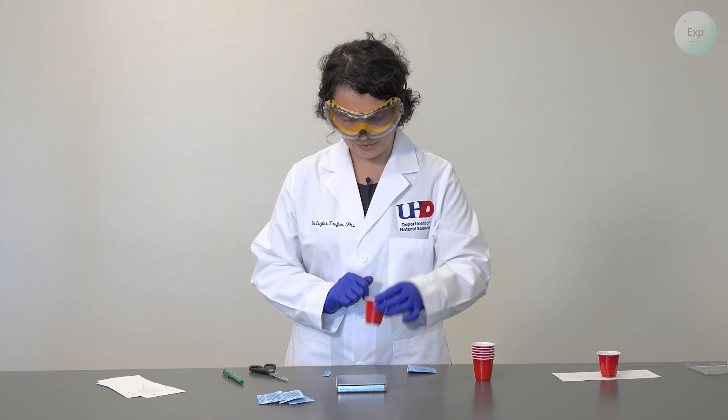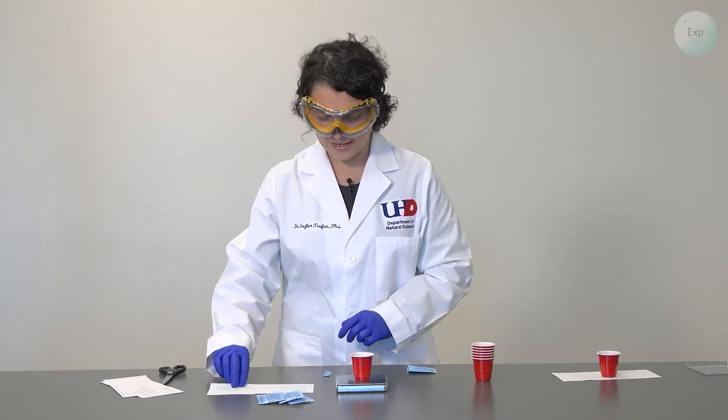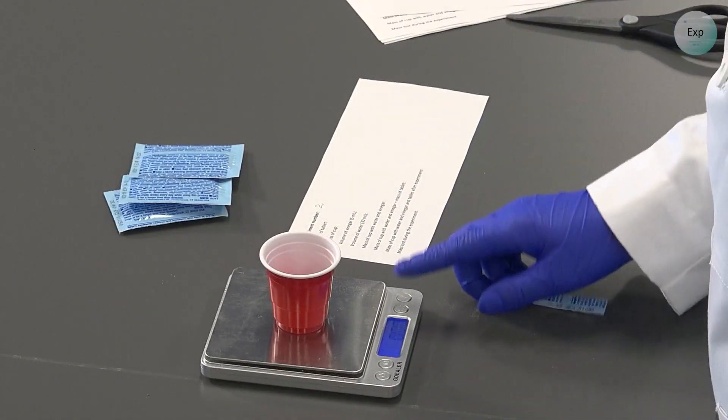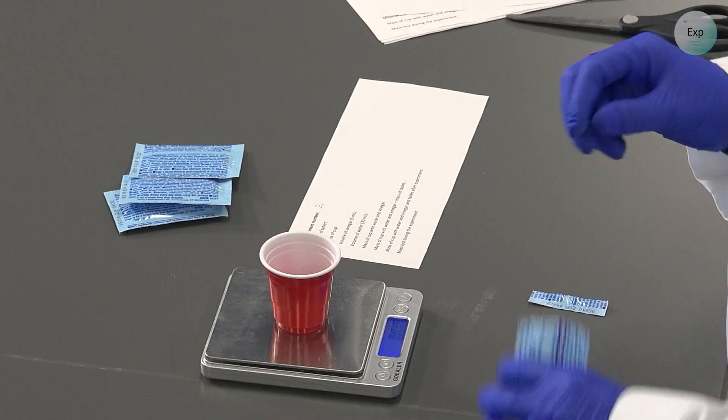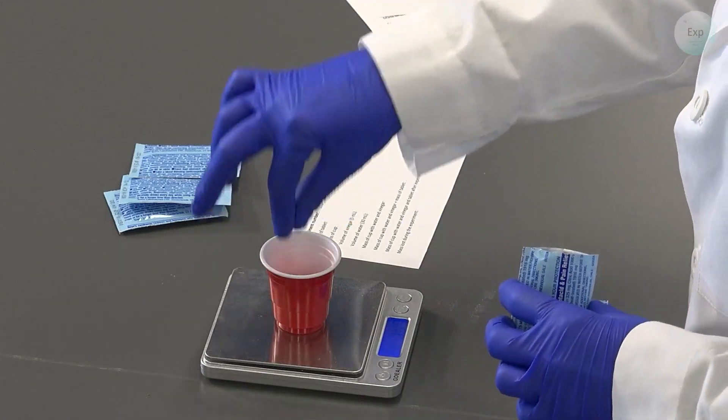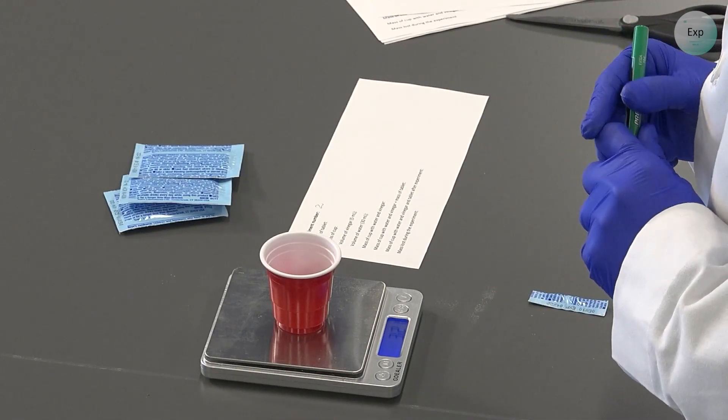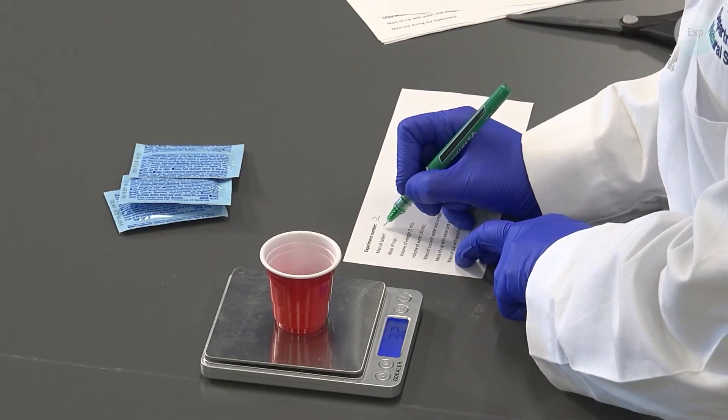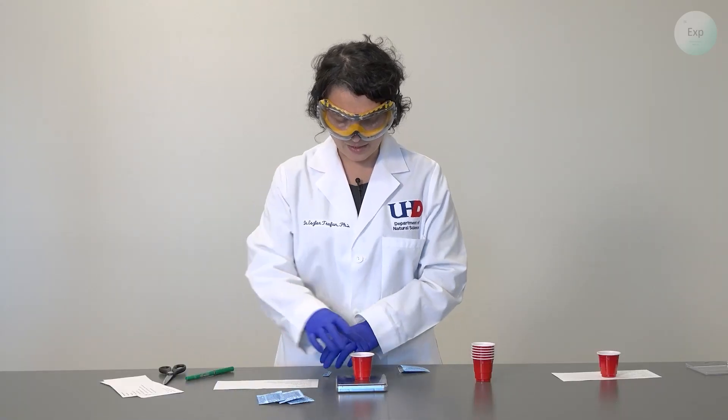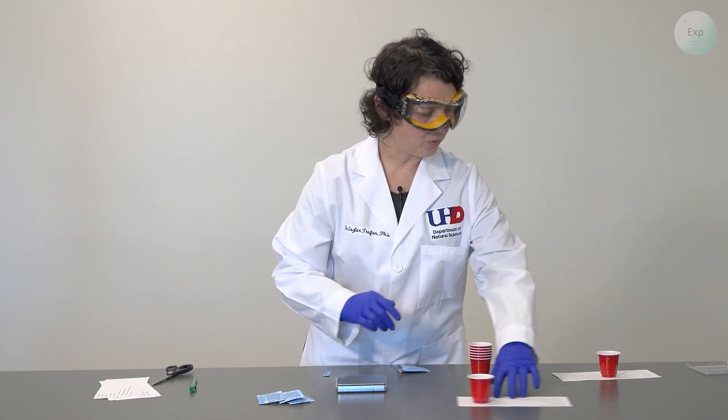Next I'm going to move on to experiment two, place another cup on the scale, take my second sheet of paper and write experiment two on it. Then I will tare my scale and place the next Alka-Seltzer tablet inside. The masses will be relatively similar so this one is also 3.21 grams. Once recorded I will place my tablet in the cup on the piece of paper and move it to the side.